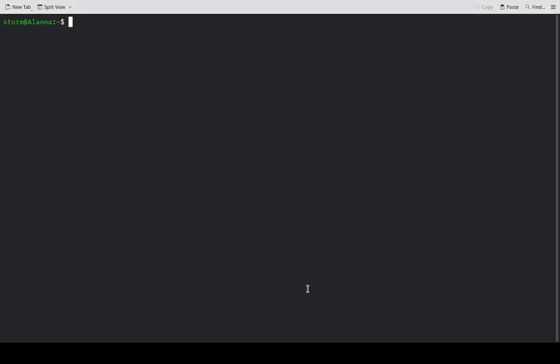Hello, my name is Matthew Brown and I'm going to teach you how to use the Linux bash command line to concatenate multiple CIF files into one quite easily.